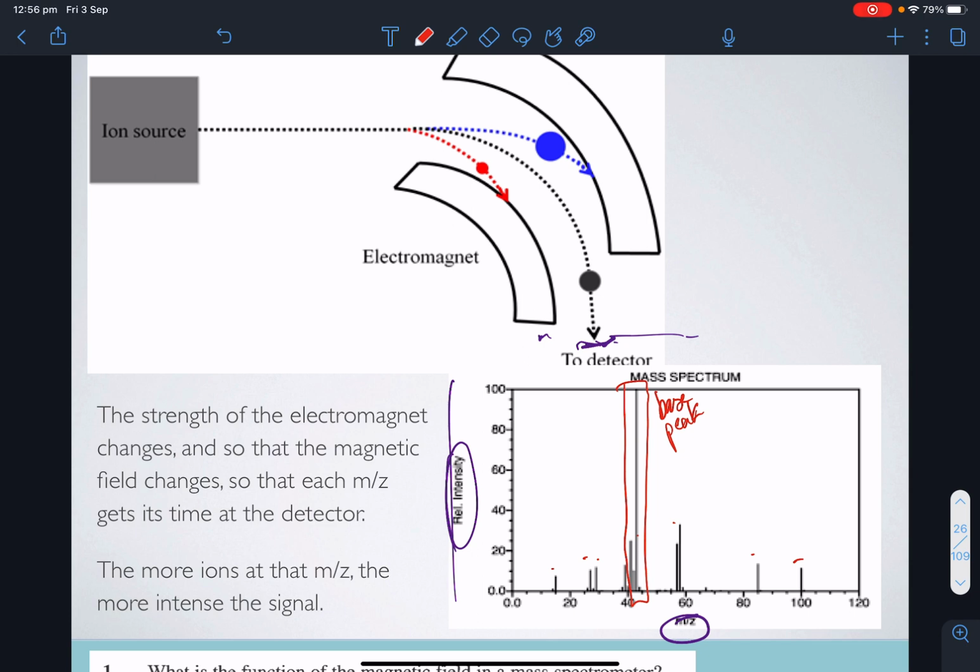So this one had a lot of different fragments, but the most stable fragment had a mass of about 42 mass to charge, or 42 grams per mole. Okay. Now, there was some smaller, there was some larger, but you'll see that 100 is the largest here. So 100 mass to charge. There's no other peaks after that. So it's saying that the largest fragment we saw was 100 grams per mole. And we'll come back to that in a second. That also has another name. It most likely is, and for our case, the parent peak. And we'll get to that.